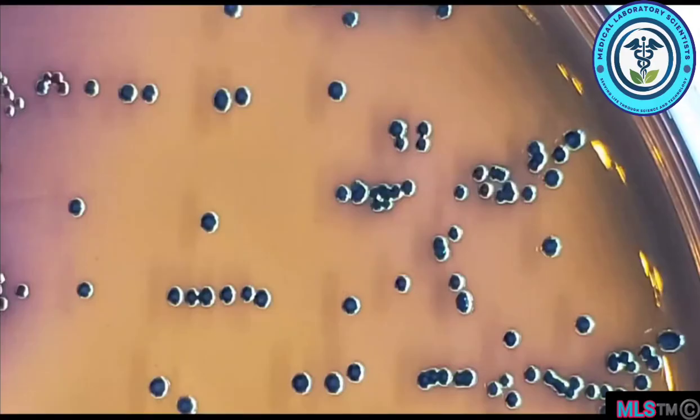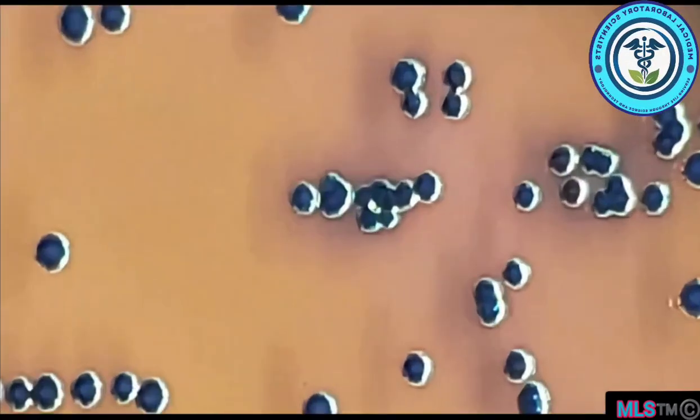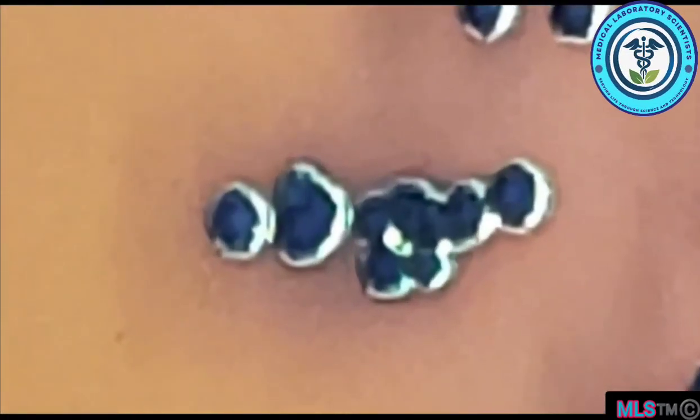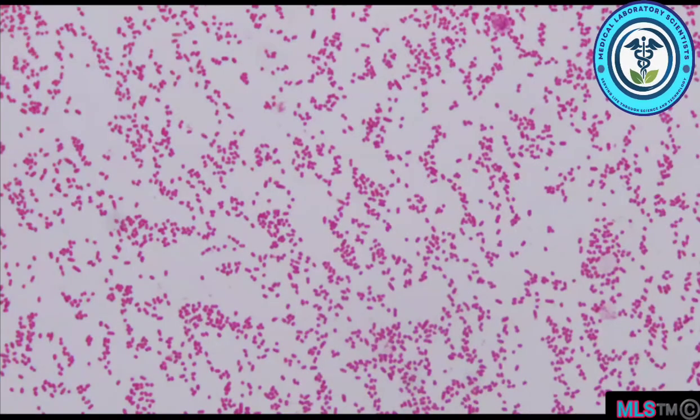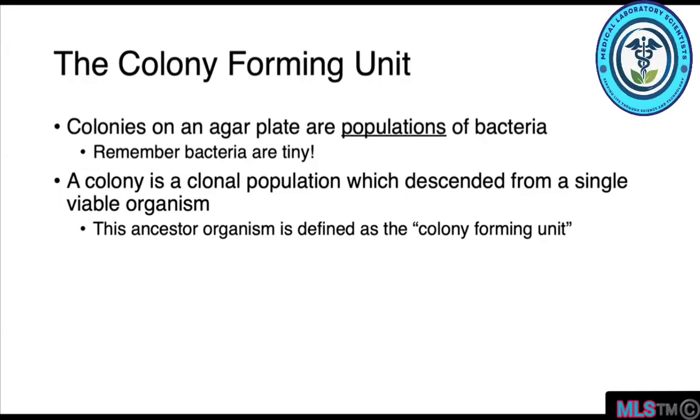our naked eye? If we look at this zoomed in picture of an E. coli culture growing on eosin methylene blue, we can see these bacterial colonies. And if we zoom in on them, and then zoom in some more, and zoom in some more, what you'll find is a homogeneous population of organisms. Colonies on a plate are populations of bacteria.